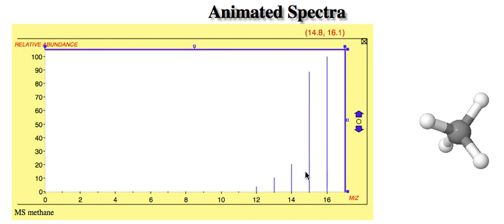Now, you also see peaks here at 1 unit less each time. This is missing one, missing another, missing another, missing another, and you don't see anything else below that. Okay. If you were trying to figure out what this peak was from, it'd be having one less mass unit. There it goes. One of the fragments broke off. Let's go back to here.